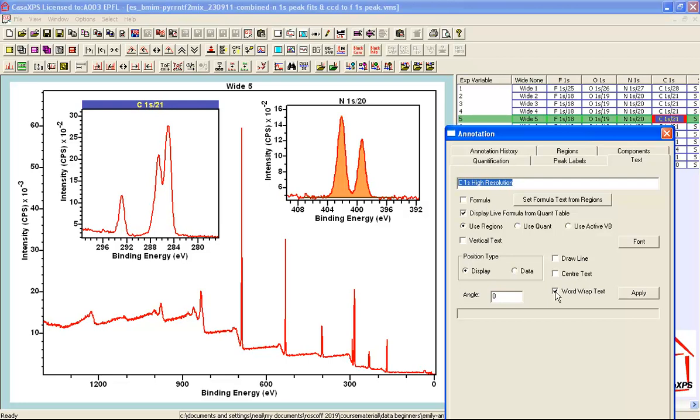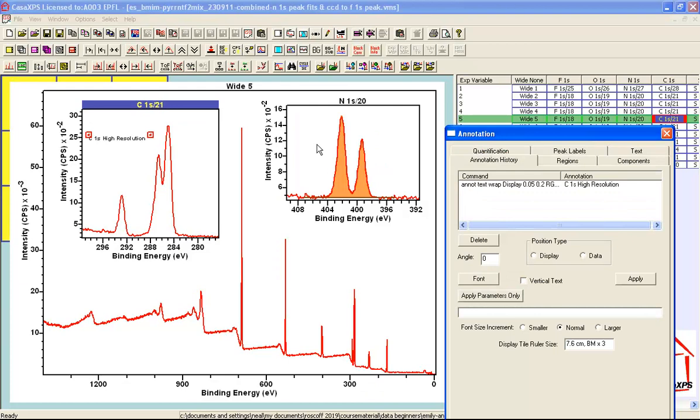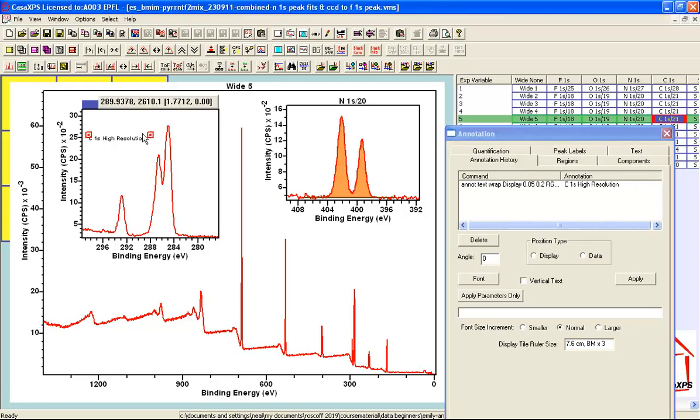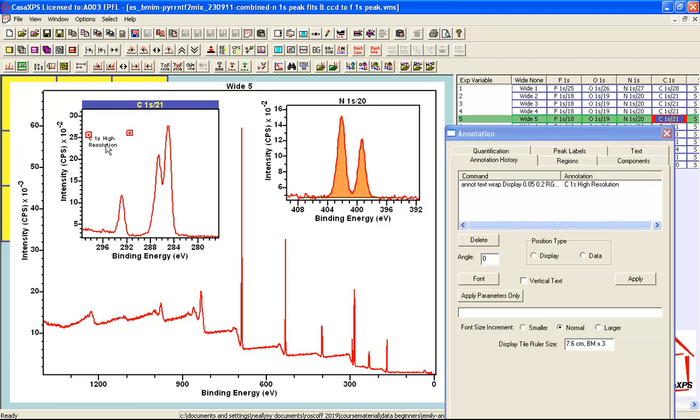Now I'm going to illustrate a new feature and this is word wrap text and when the annotation history is active there are now two boxes that are associated with the text. The first one positions the left hand side, the second one positions the right hand side of text and the distance between these two will determine the amount of text that can be drawn in one line. So if I reduce the size of this by moving the right box towards the left box then we can see here that it says carbon 1S high resolution and it's printed over two lines.